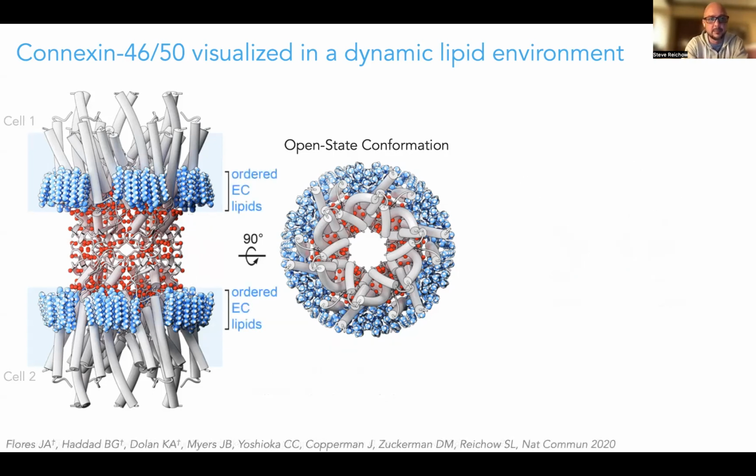Okay, so back to the lipids. I'll remind you that these nanodiscs generate a lipid bilayer, but the only lipids that we're resolving could be mapped to just a single leaflet of the lipid bilayer. And so this is quite striking. The other striking feature was the long-range stabilization of the local lipid environment. It wasn't just the annular lipids that were being resolved, the ones directly adjacent to the membrane protein, but we're seeing second, third, and even fourth order stabilization for the local lipids. And this was quite striking to us.